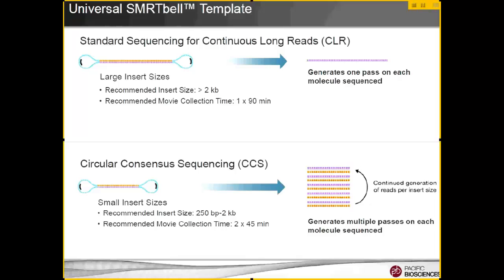I should jump back a bit and say that one of the things about the Illumina technology is that the longer their runs go, the more likely you get an error. If you come to the class that's on Thursday, when I talk about the basic initial quality processing, I'll show you how, towards the end of an Illumina strand, you always get more and more errors and lower quality. That's not the case with PacBio. They have generally a bad quality, I mean 85% accuracy, but it's no different from the beginning until the end.